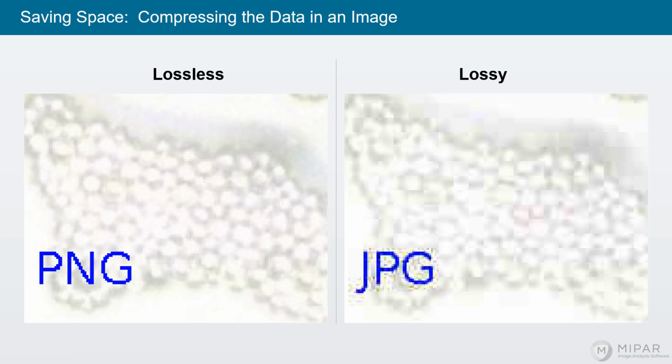Now, if you know what you're doing, you can decide what level of accuracy and detail you care about in your image. And you can use a level of JPEG compression that preserves that amount of detail. So you can use a light enough compression that you don't destroy what's important to you. Which, okay, is fine. Great. You get to save a lot of space on your hard drive. But just be aware of what you're doing when you do it.